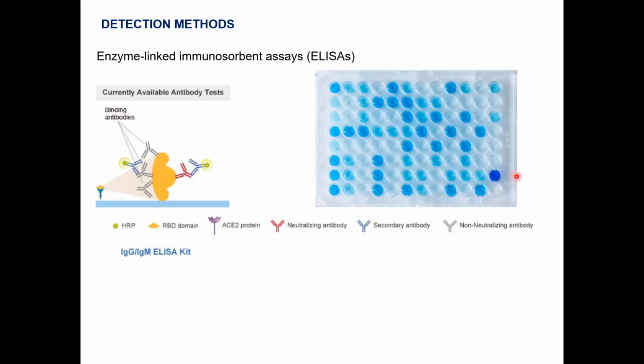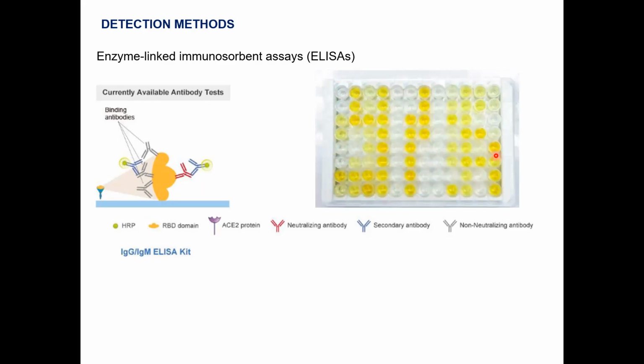It shows that the level is high, that there are a lot of particles in it. If you have an empty one here, it means that the level is lower and lower. But every time you need to consider that you need to stop the measurement, because if you just leave it on the desk, it is going to go on over and over, and the differences won't be visible anymore. So the companies prescribe, or advise you, to do it for 10 minutes and then check it, because after that, you need to stop the reaction.